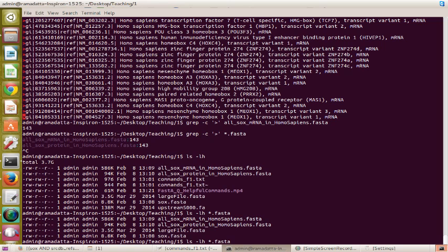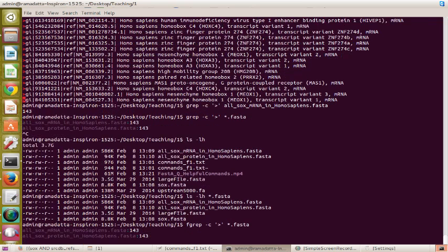For now, to give a simple idea, I will tell you how you can count quickly using another flavor of grep. It's called fgrep, which is fast grep. This one does not check for expressions, it just checks for the fixed pattern, so it's very fast, faster than grep. You can see if I run the same command with fgrep, it takes much less time than what grep was taking. So we just wait.